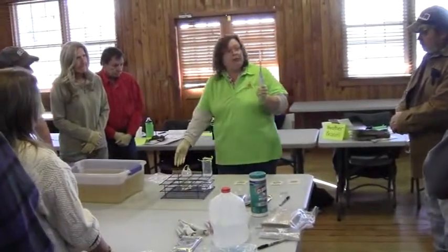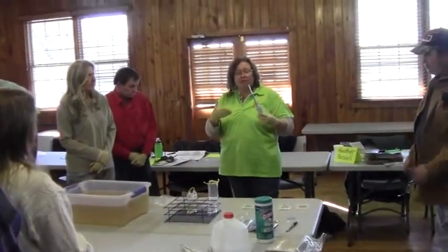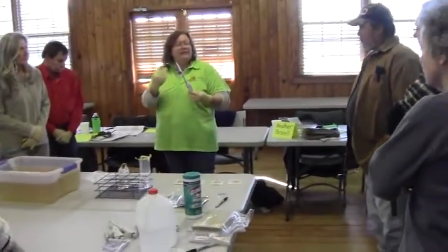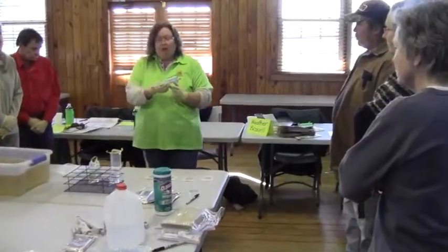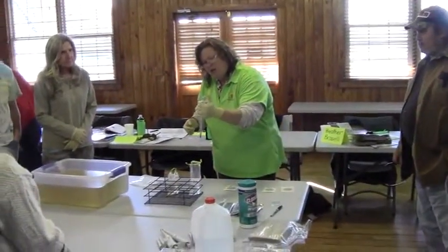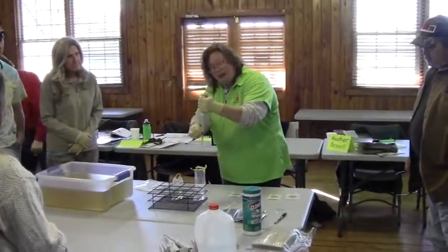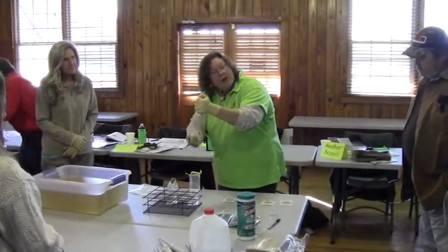You also don't want to touch anything to the tip, because if you do, you need to take the tip off and start again — you're going to basically contaminate it. So I'm going to turn it upside down, and you're going to push it all the way in, which will dispel any air that's in it.